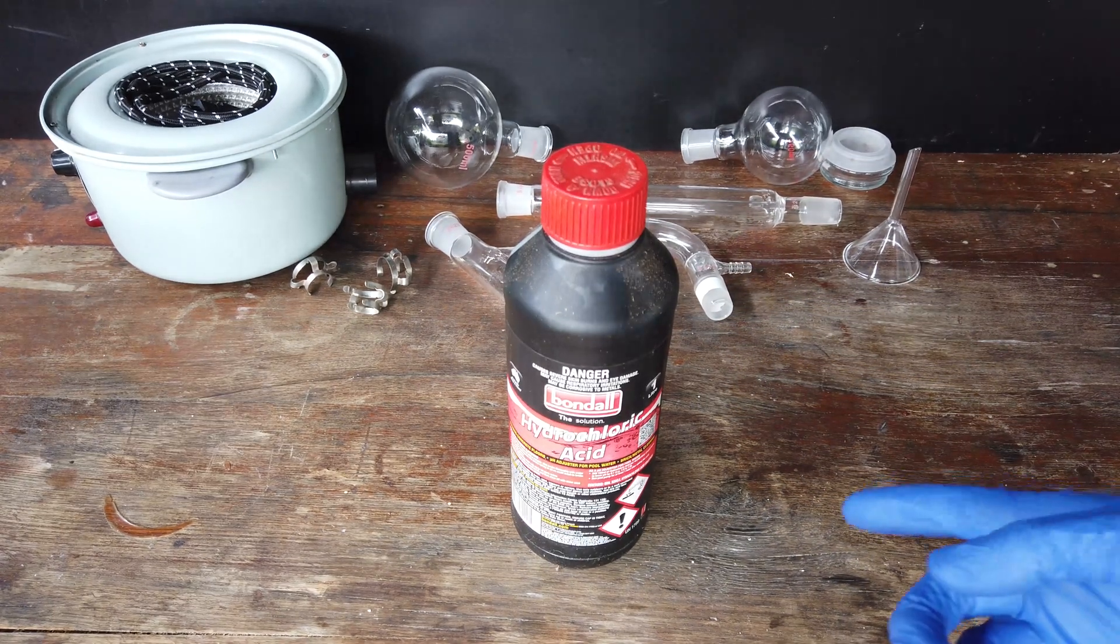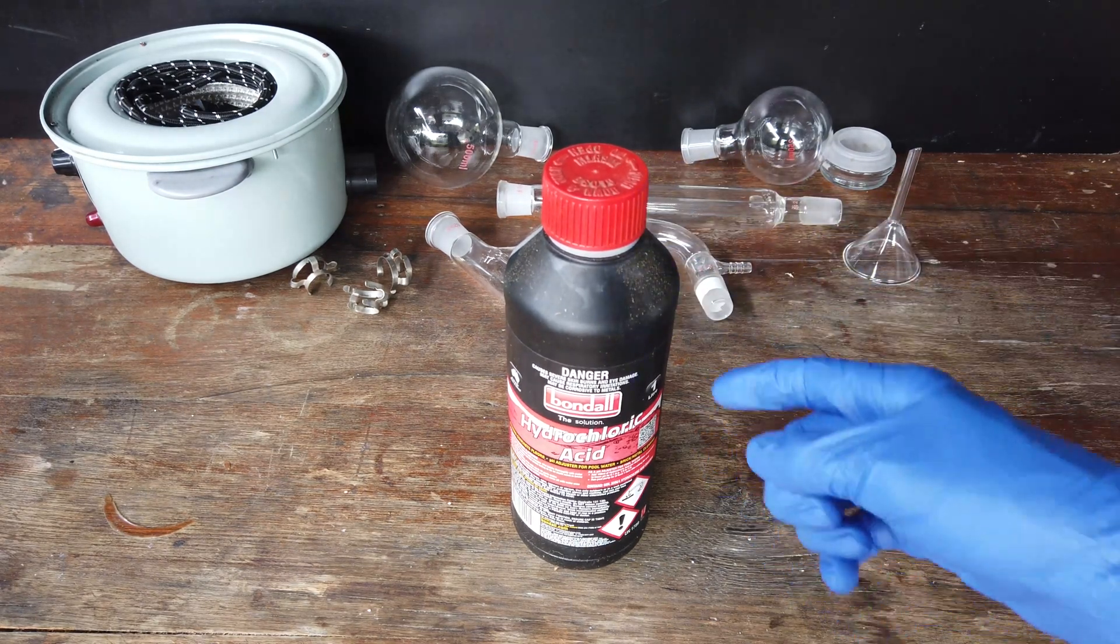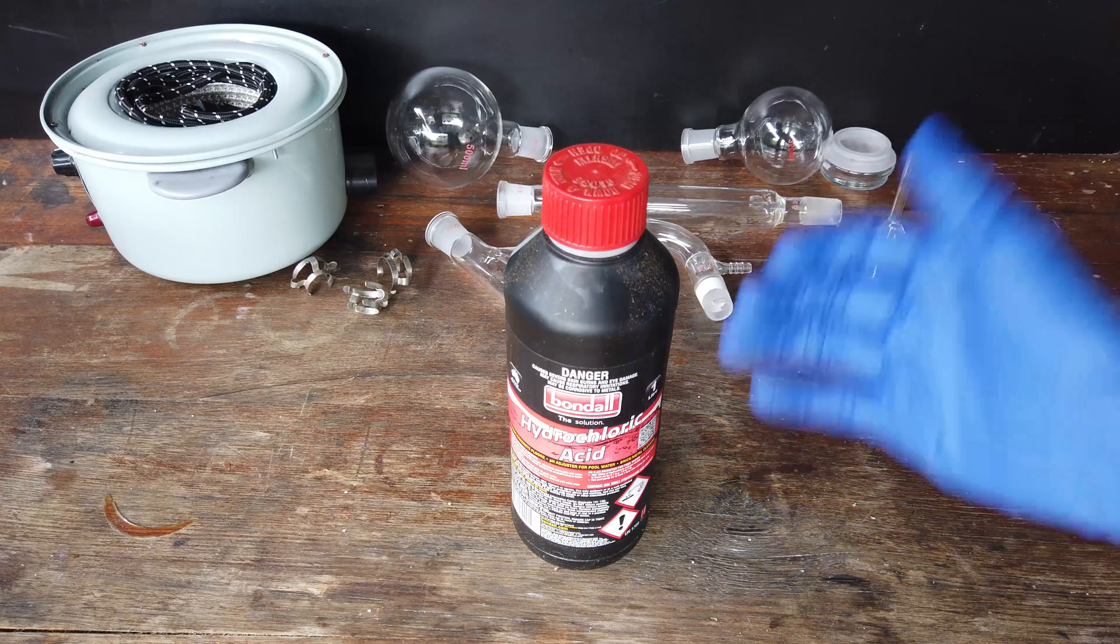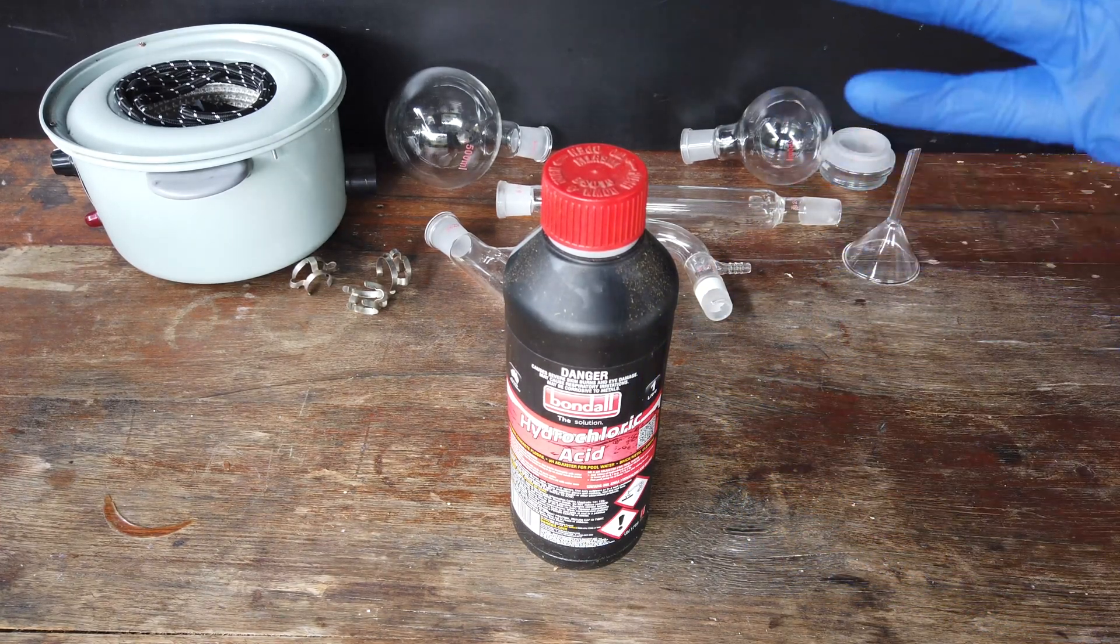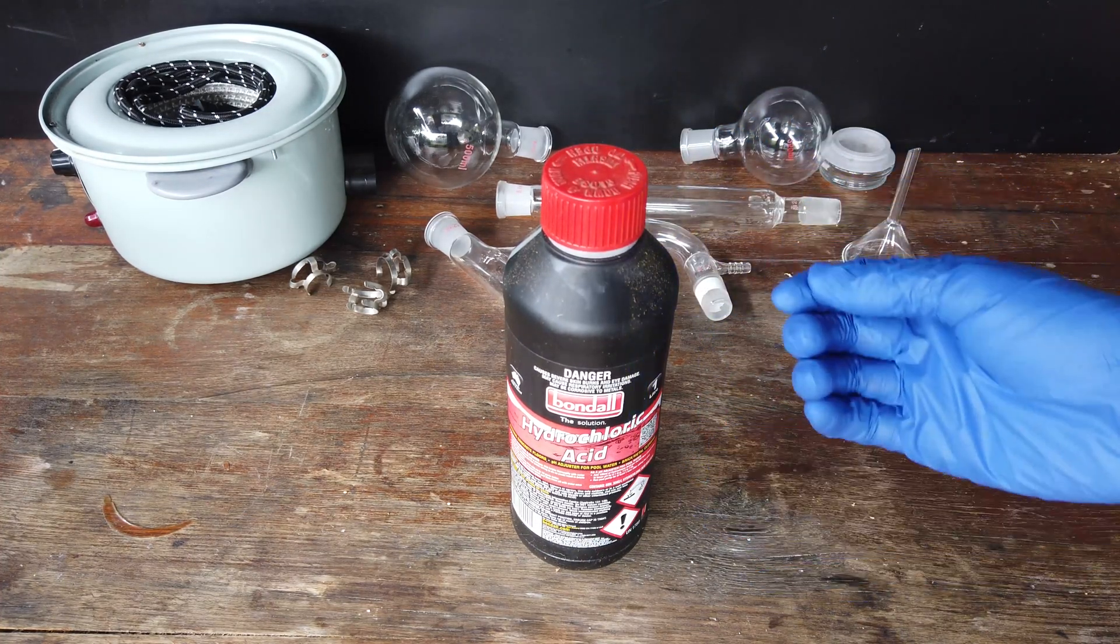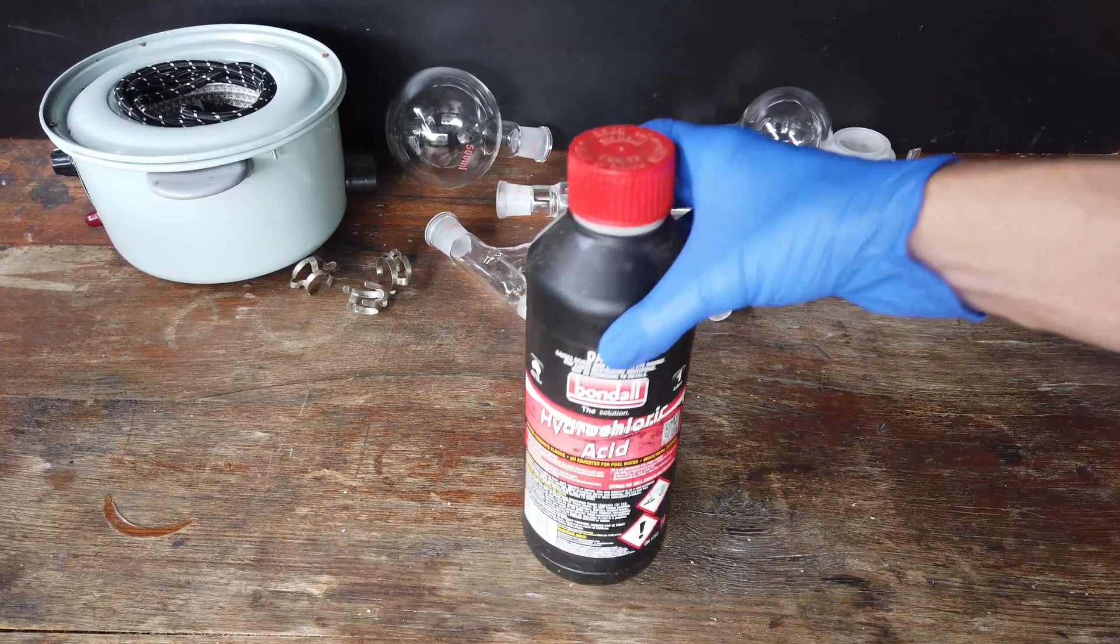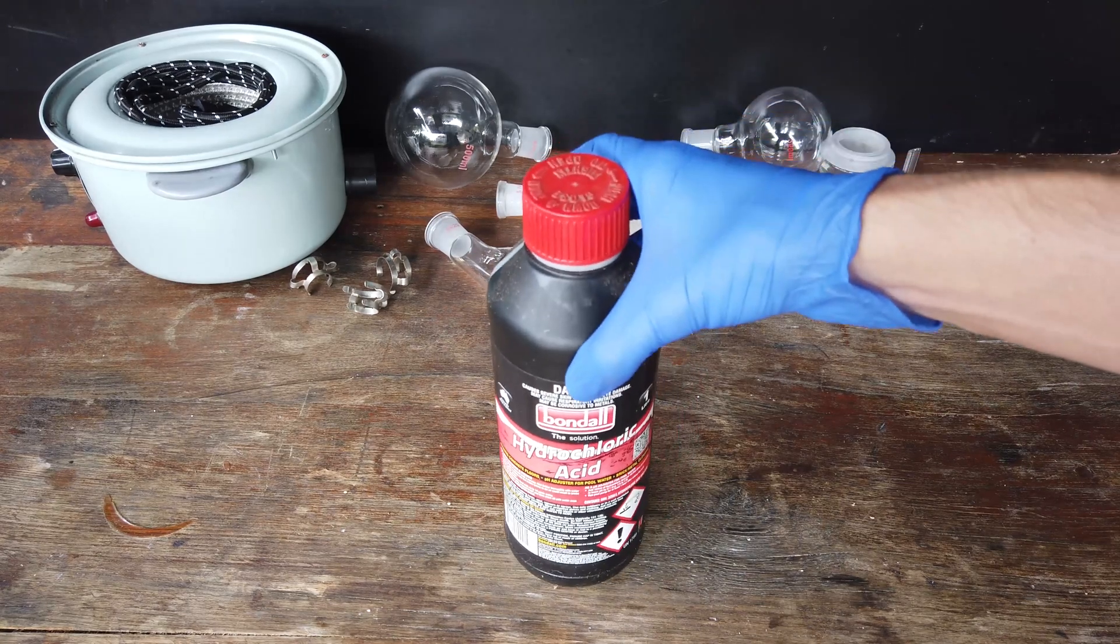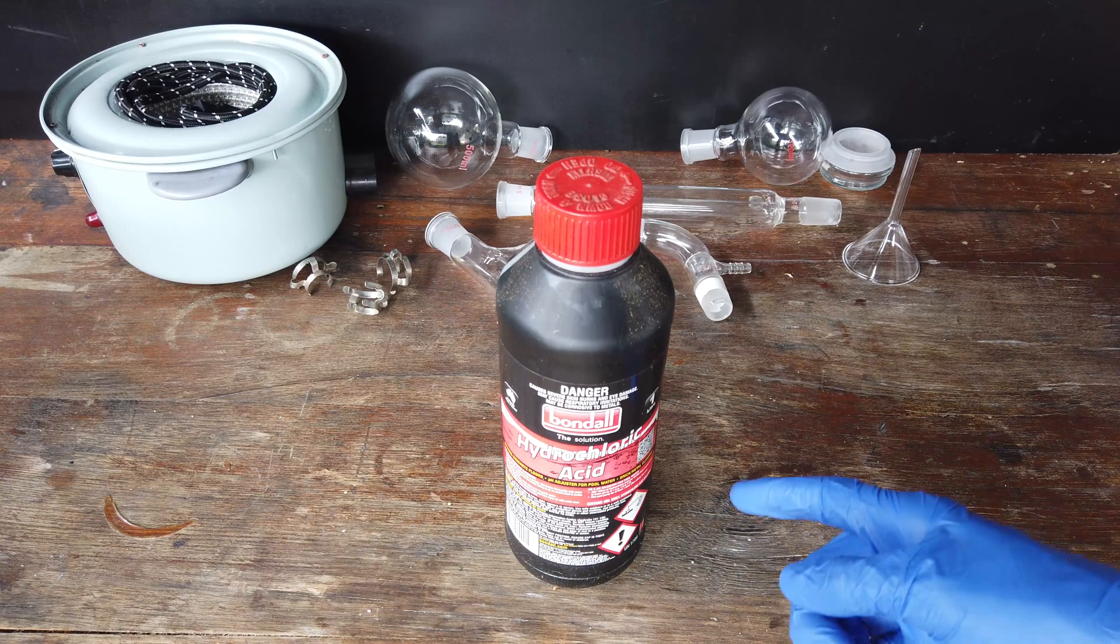The one downside to distilled hydrochloric acid is that the azeotrope of hydrochloric acid and water is about a 20% concentrated solution of hydrochloric acid. So as we boil our azeotrope, the distilled product that we're going to get is going to be quite significantly diluted compared to our concentrated 32% hydrochloric acid that we get here, but I think that's a pretty fair trade-off for purity.